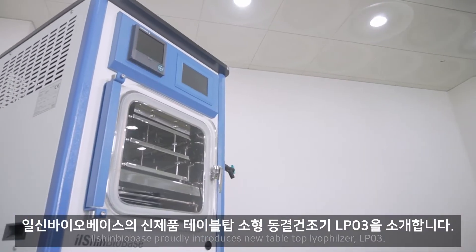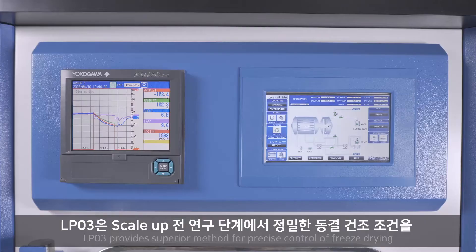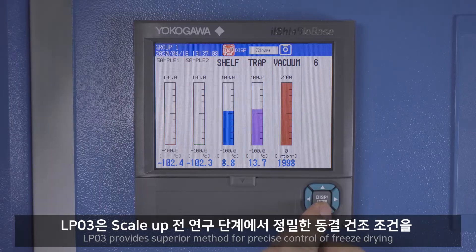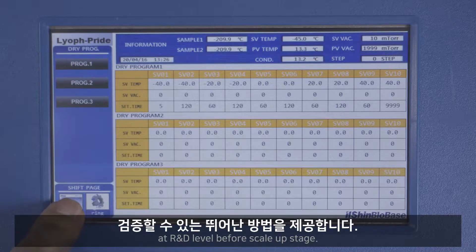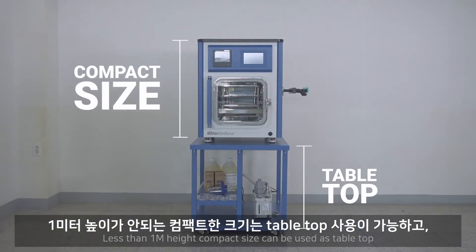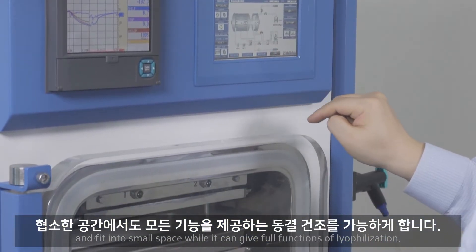Ilshin Biobase proudly introduces the new tabletop lyophilizer, LP03. LP03 provides a superior method for precise control over freeze drying at R&D level before the scale-up stage. Its less than 1 meter height compact size allows it to be used as a tabletop unit and fit into small spaces, while still providing full functions of lyophilization.